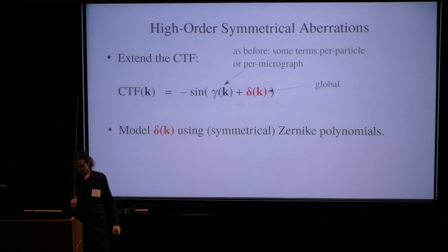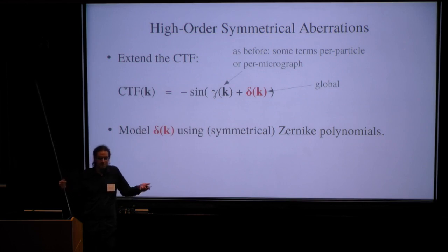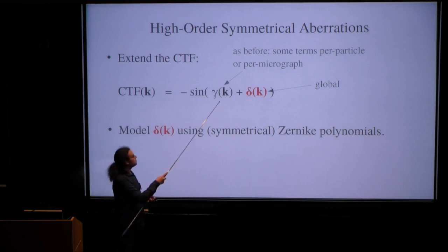And this is based on the expectation that the higher order aberrations change more slowly than the lower order aberrations. That is something that microscopy people seem to think. I have no experience with it. But now we look for a constant such offset while this here varies.